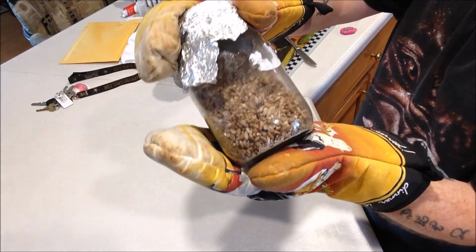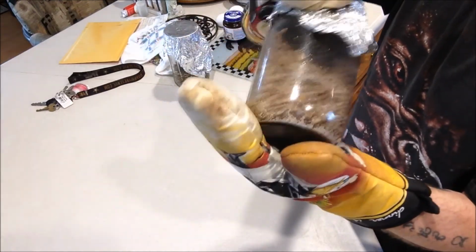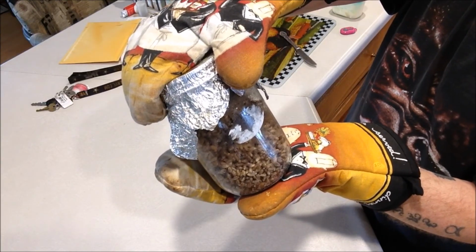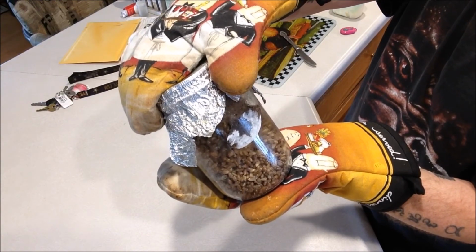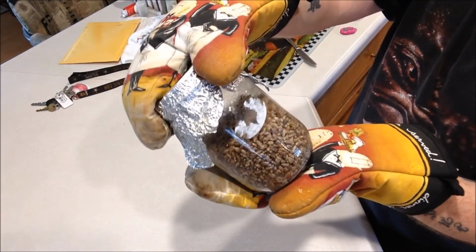Once it cools off, you can inoculate it any way you choose. And you've got grain spawn. Easiest way possible. No soaking, no boiling, no laying it out to dry. Saves a huge amount of time.